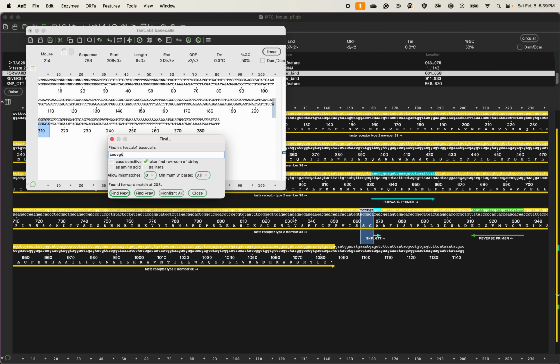So, is it right? G, C, T, G, C, T. Yep, right on the top strand here. G, C, T. Okay, let's find next.